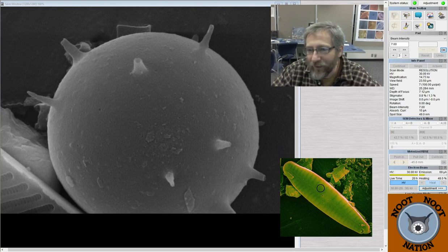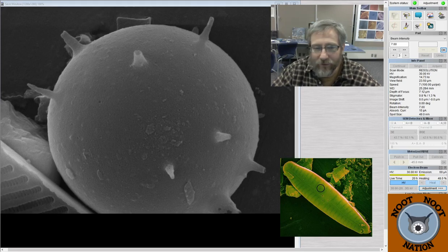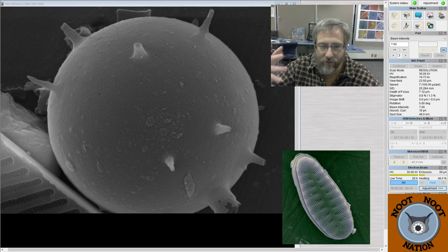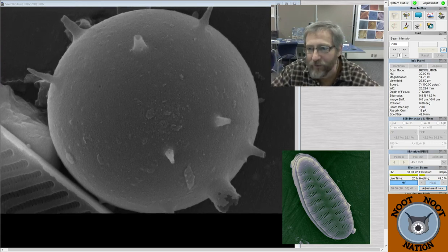You'd like the angled shot? I have that. It's just a TIFF. I'll post it to the Discord along with maybe the PDF and also the STL if you wanted to print it on a 3D printer.